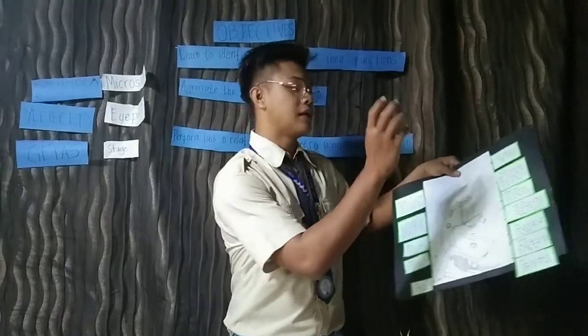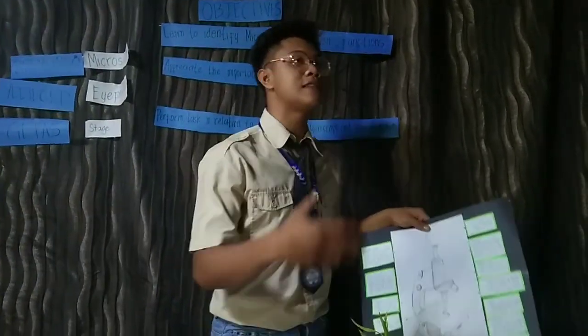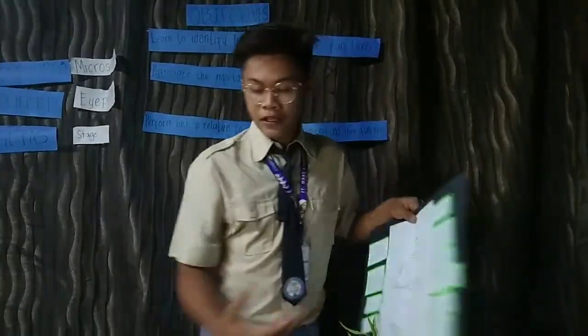So each group I will give this picture. You need to discuss it in your group, and you will be graded according to the rubrics.